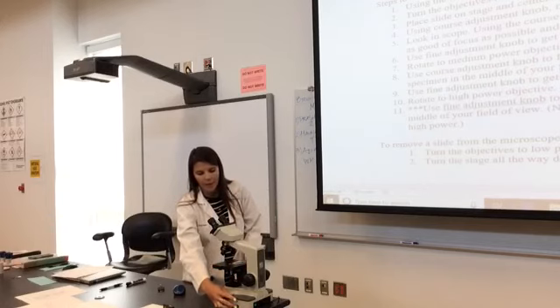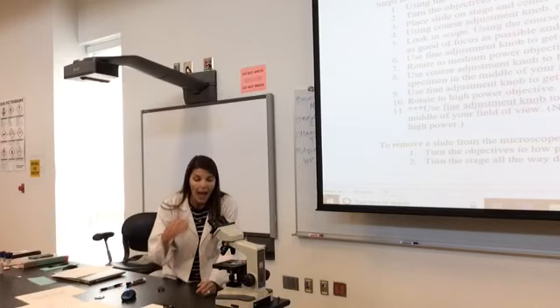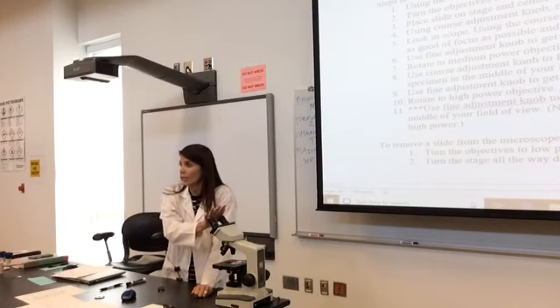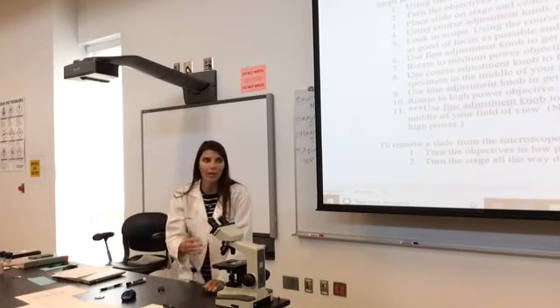Okay? Now that I feel like it's in a good location, a good position, I am going to begin trying to focus. Some of you like to use both eyes. I do not. I like just using one eye. You do what's comfortable for you, okay? Because I can make it work either way.